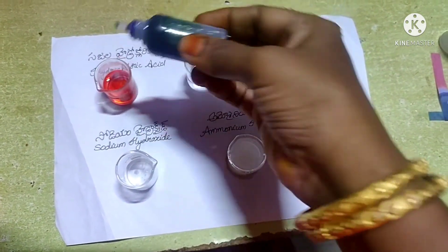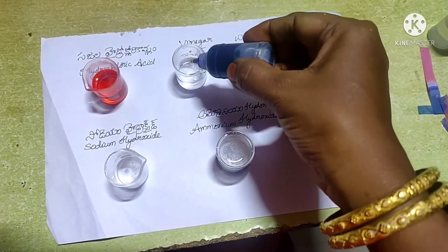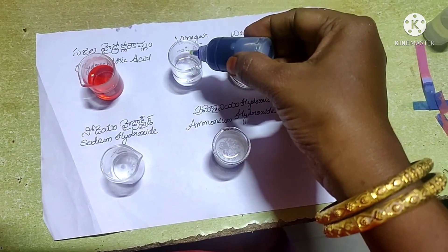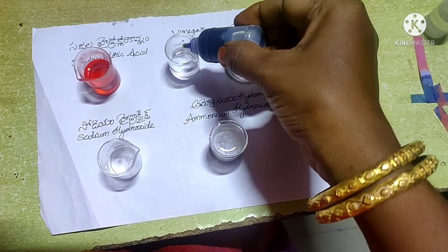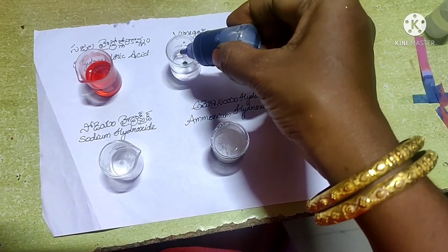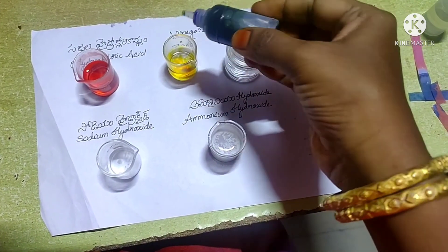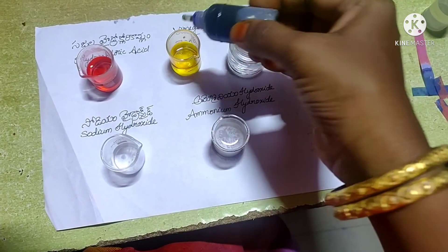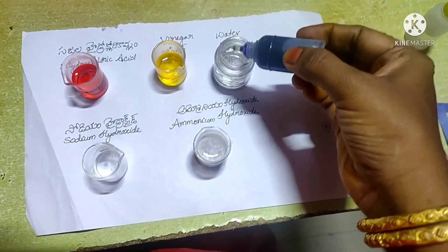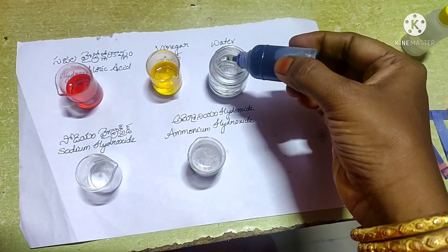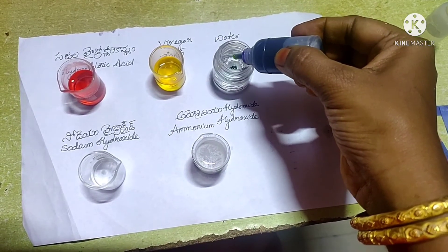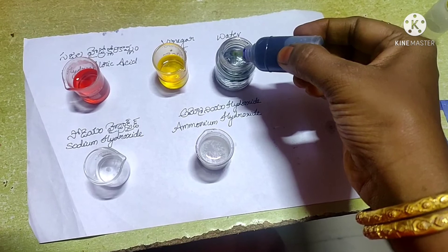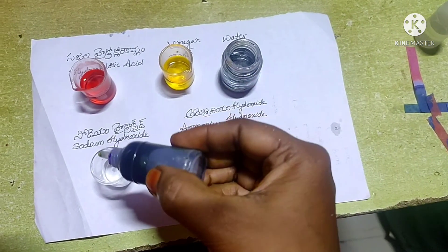Add a few drops of universal indicator into dilute hydrochloric acid — the solution changes its color to red. Next, test with vinegar: when we add two drops of universal indicator into vinegar solution, it changes its color to yellow. With water, it does not change its color — it remains green.